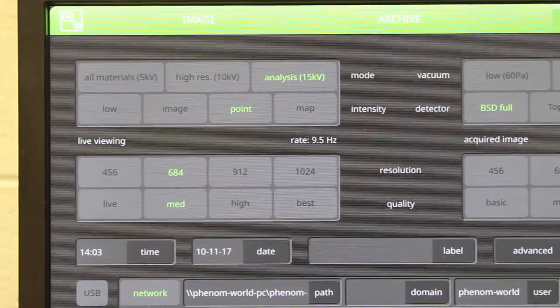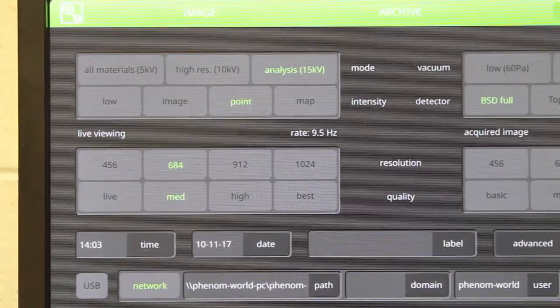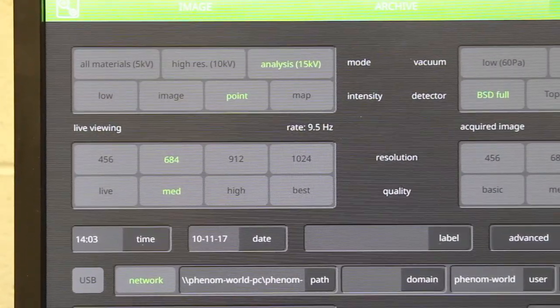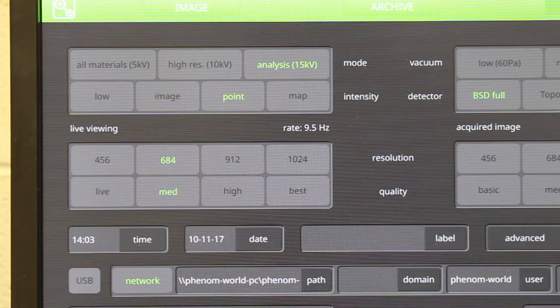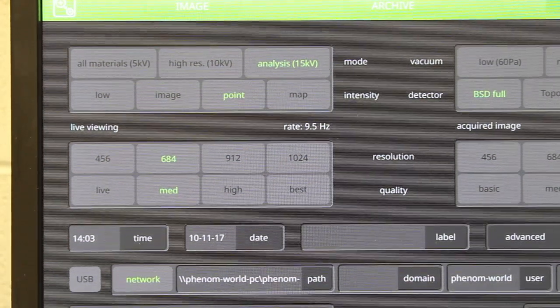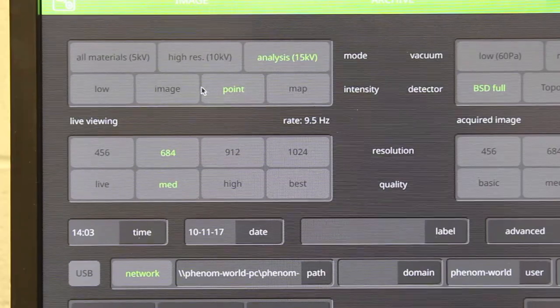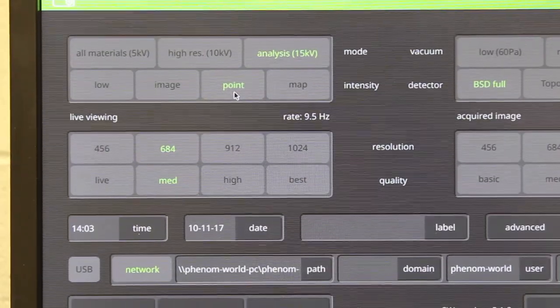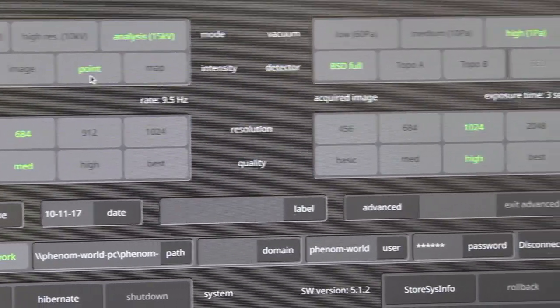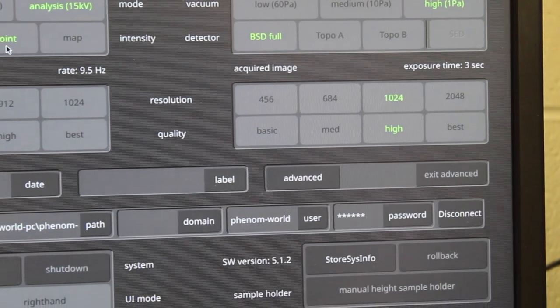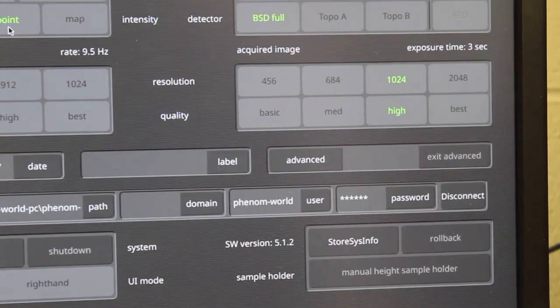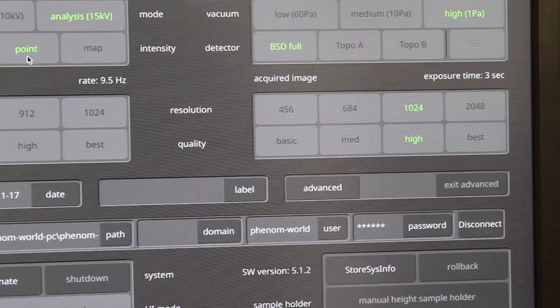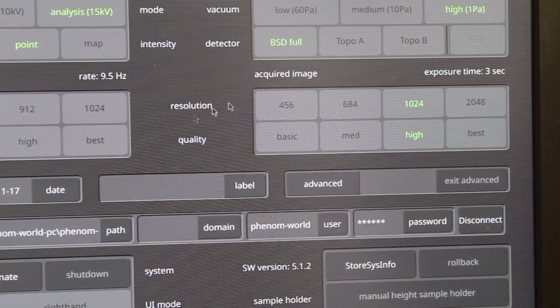Here are the settings for the SEM we want to use for EDS analyses. We want to use the analysis setting of 15 kilovolts, point analyses, and the backscatter detector.